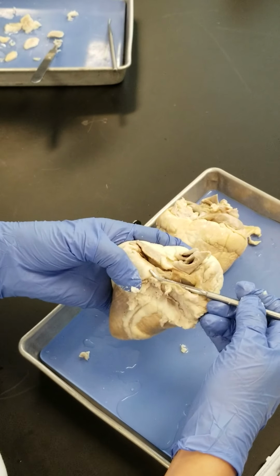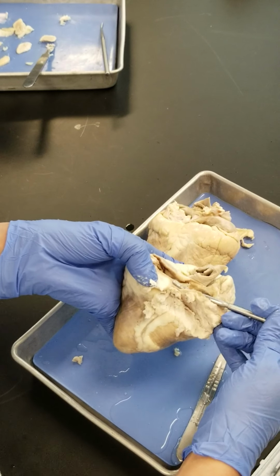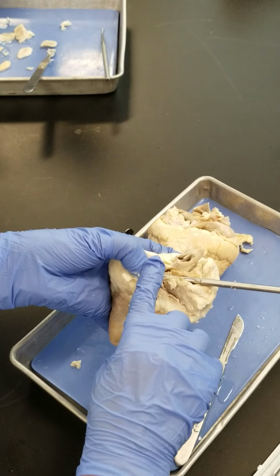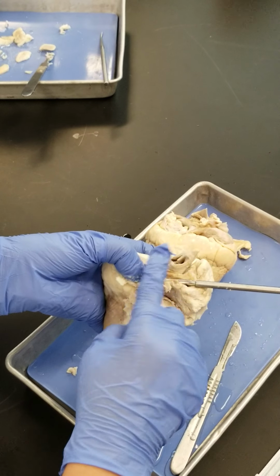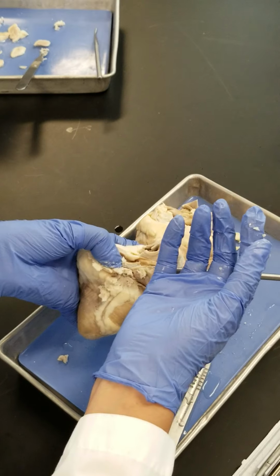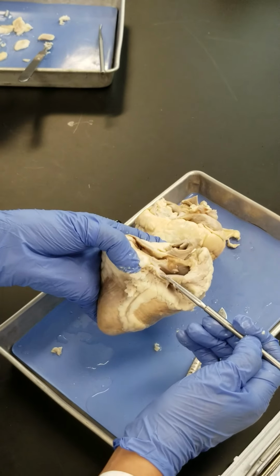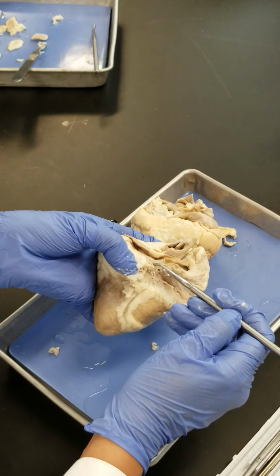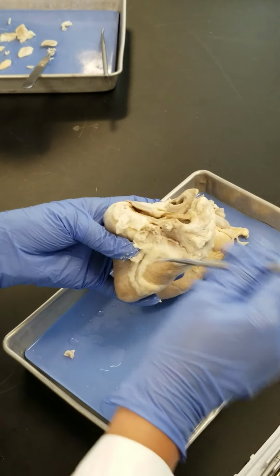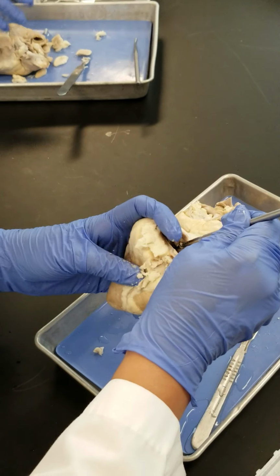That is this one. Do you see this shape? There's a little groove there, the lower part of that. The upper part has been cut, because they have cut all of this upper part of the atrium. It depends on the heart: some have the whole atrium, and some have been cut lower. But from here you can still see that there has been a vessel here. So any question regarding the right side? The same way is for the left atrium.